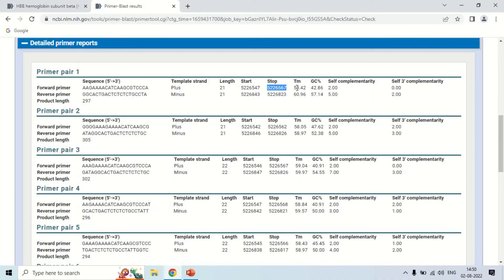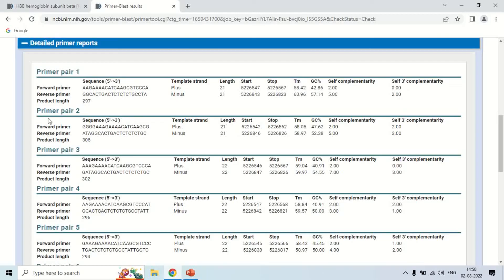The melting temperature of the forward primer is 58.42°C and the GC content is 42.86%. It also shows the self-complementarity ratio — how it can self-complement or form a hairpin or secondary structure. The reverse primer section shows its sequence, template strand direction, length, start and stop positions, melting temperature, GC content, self-complementarity, and self 3' complementarity. Similarly, the details for the second primer pair are shown.